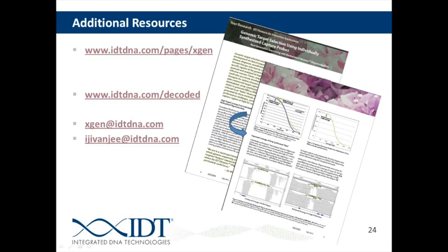Okay, and let's see here. There's one more question here, and I guess I'll direct this to Adam. NCBI is not comprehensive for variants. Is Ensemble better than NCBI or the UCSC genome browser? And then also, do we have any information about GENCODE? Apparently that's another database. I'm sorry, that's a database I'm not familiar with.